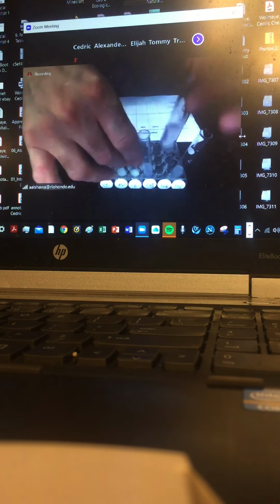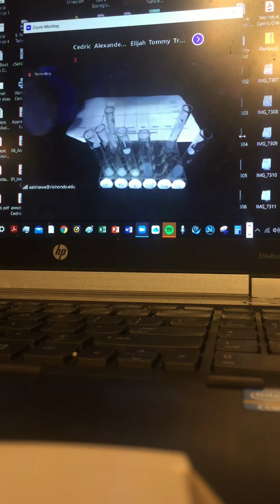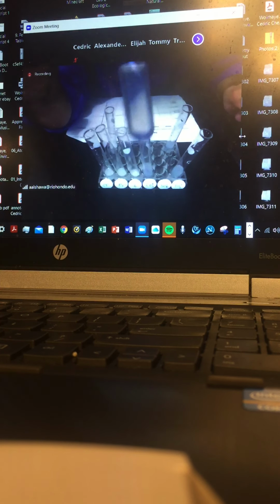Now I'll do the same. So this is used to be sulfate, remember? Used to have some solid. Okay, so this is sulfate. Let me add maybe 2 drops of the nitric acid. But obviously, it's a little bit more clear.